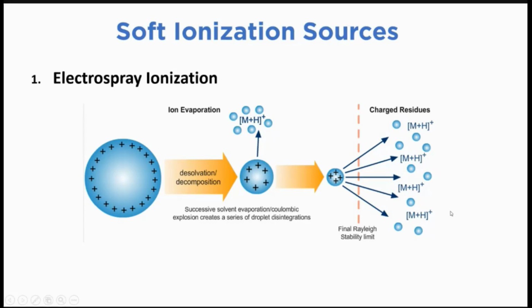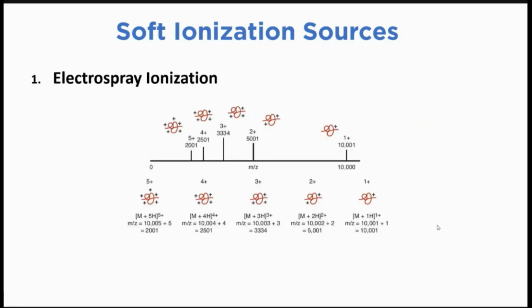So there should be no longer any water or solvent at this point, and you actually have a proper molecular ion where your molecule is positively charged or negatively charged, and it's not necessarily because your solvent is stuck to it. What's really cool about electrospray ionization is that it works very well for large molecules and it leaves them intact. So if you have a peptide or a protein or perhaps an oligonucleotide that has multiple charges on it, the mass spec can capture it.